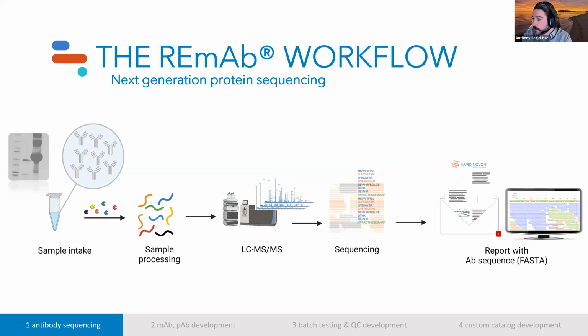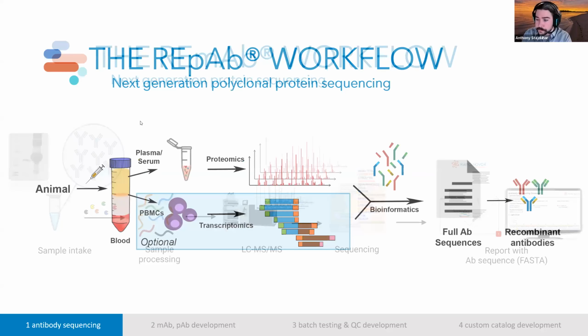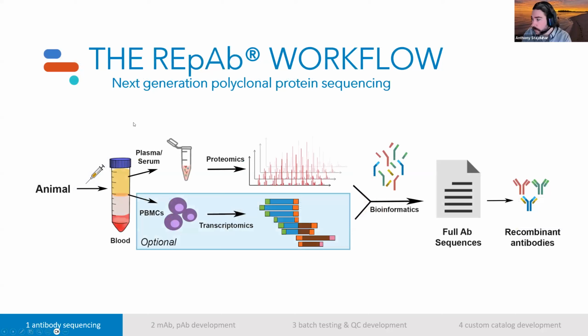And for the polyclonal antibody workflow, it's quite similar, except we do have a few other aspects to which we are trying to purify the sample a bit more. So in the polyclonal antibody sequencing workflow, we start off with an immunized animal of interest.